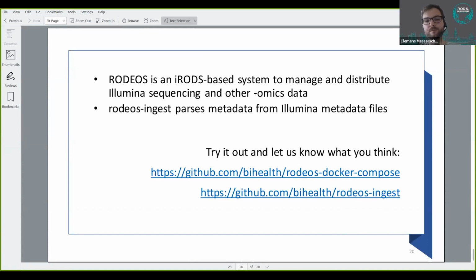All right, John. Oh, hi there. First of all, I'm struck by how similar your approach is to the one we have at Sanger. The very similar layout, probably because we use exactly the same instruments, right? As well as PacBio and Illumina, and Nanopore. But it was interesting. I see you're using CephFS as a landing stage. How are you finding that? And as a follow-on, why not use the Librados plugin?